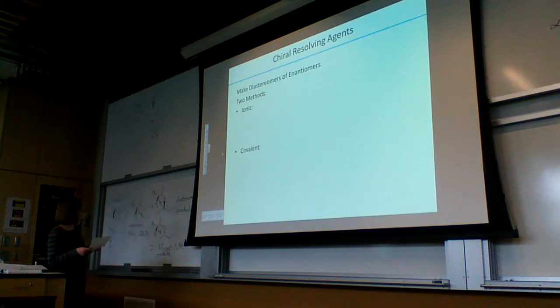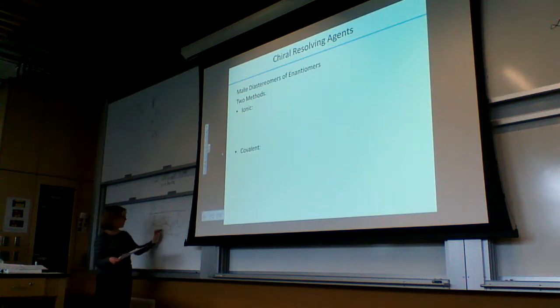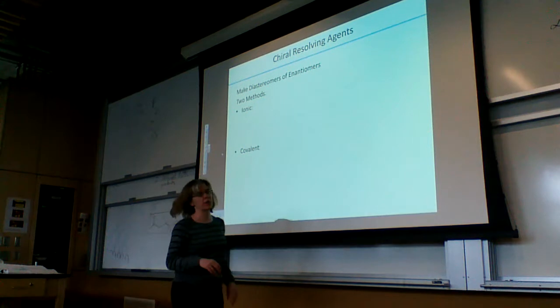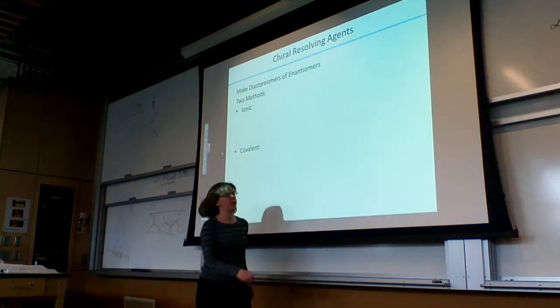Take this COSY that you had and try to assign the different protons on it to the structure. So let's all label these the same. Let's do A, B, C, D, E, F. Try to assign all of those.